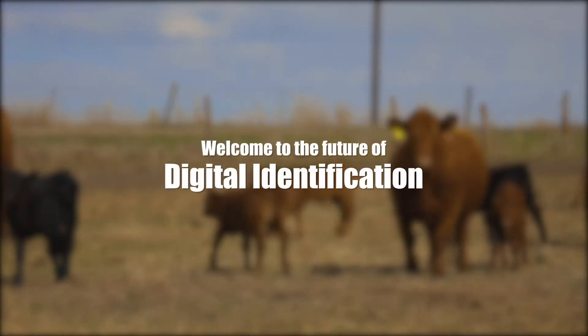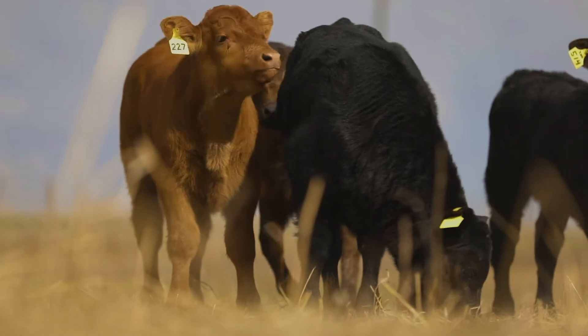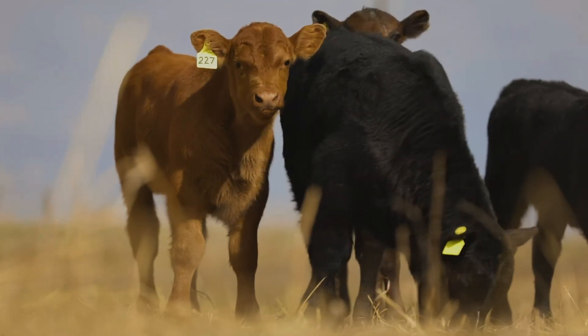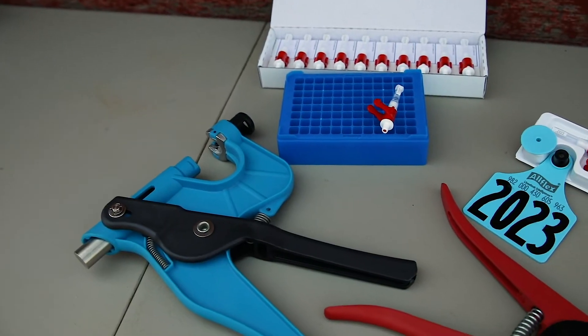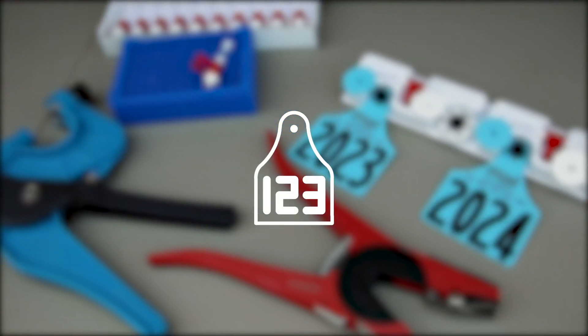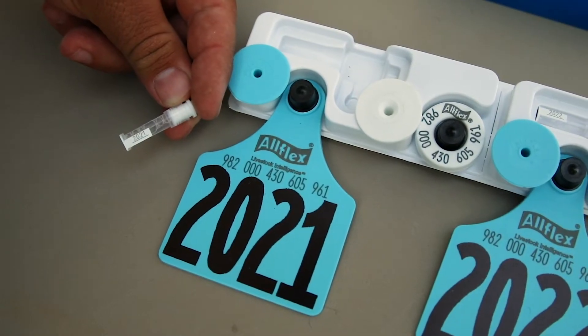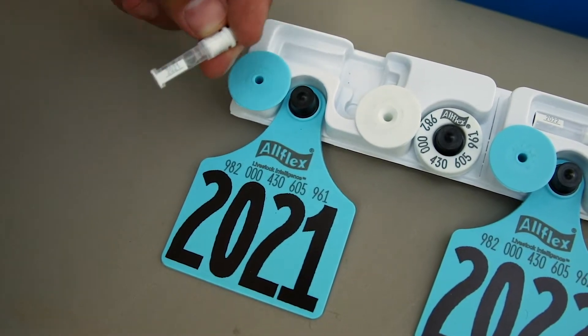With Allflex Tissue Sampling Units, there is no faster, cleaner, or easier way to collect cattle DNA. And for added convenience, you can also get Allflex TSUs with matching sets of electronic and visual ID tags. Welcome to the future of digital identification – the path to more profitable decisions.